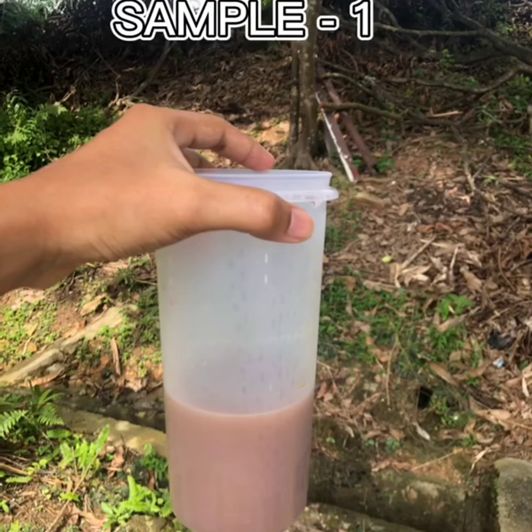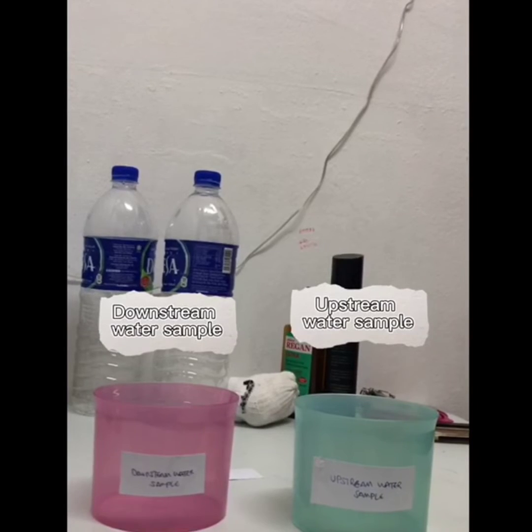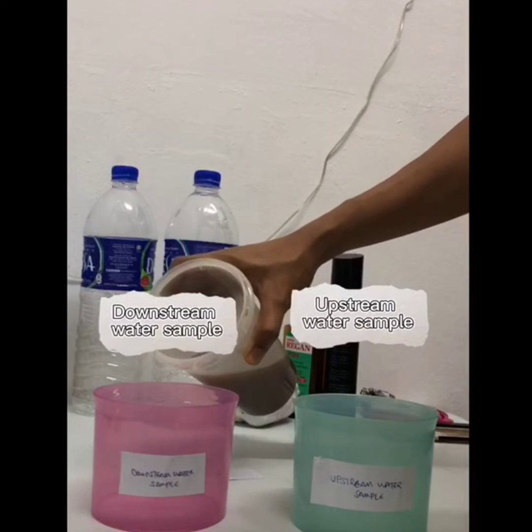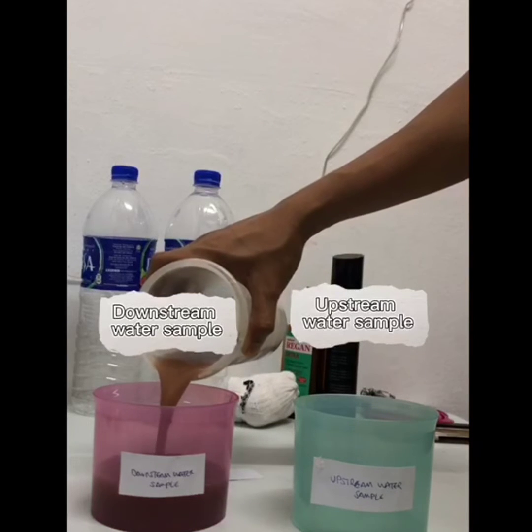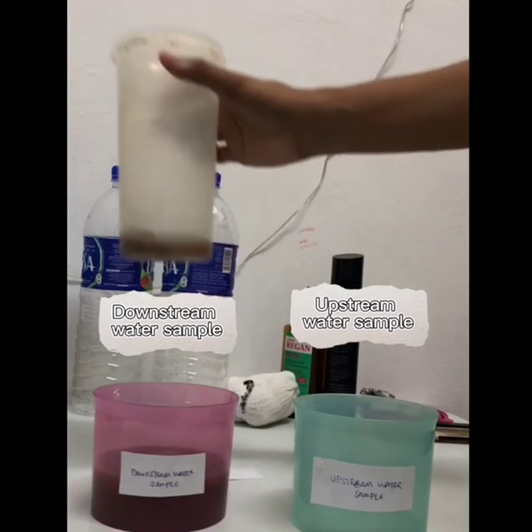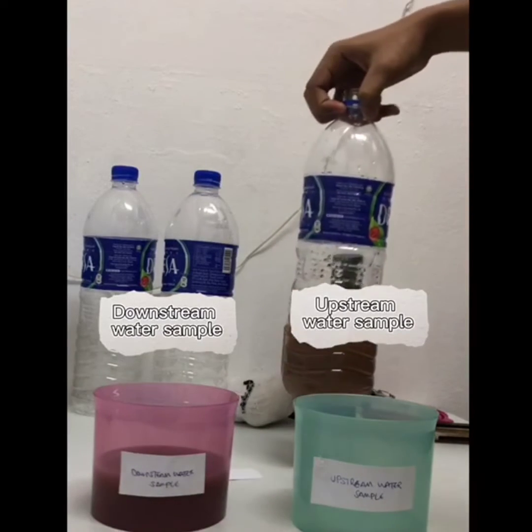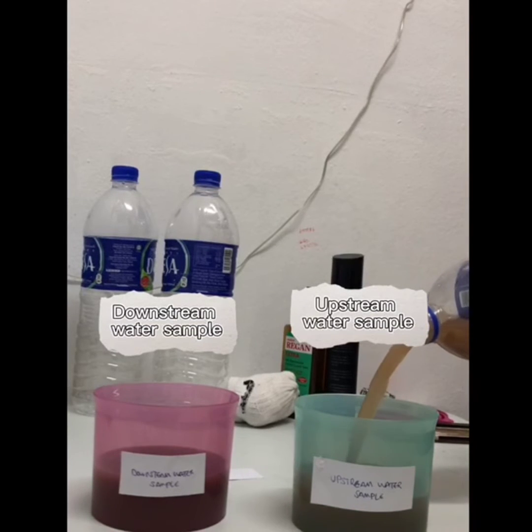So for this lab exercise, we got 2 samples, sample 1 and sample 2. Sample 1, we take it from a downstream water sample. For classification, I just put it here in this bottle, downstream water sample for sample 1, and sample 2 is an upstream water sample. I take it from the upstream water sample and just pour it here for classification.